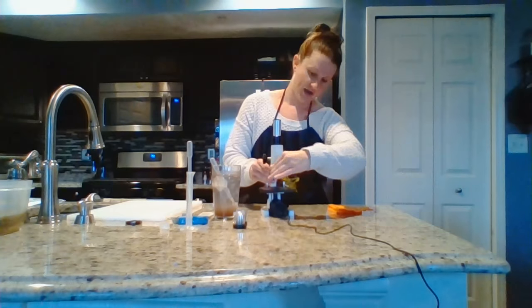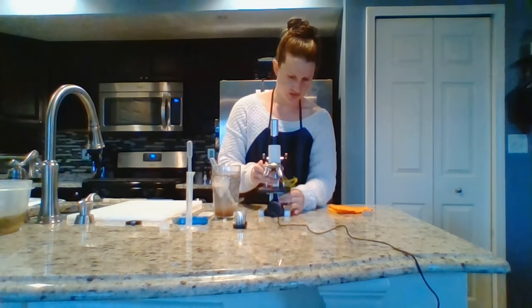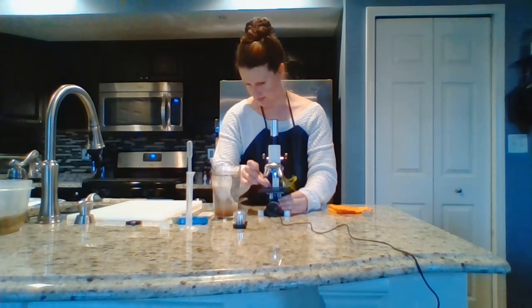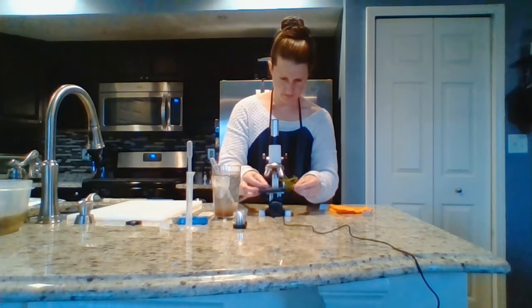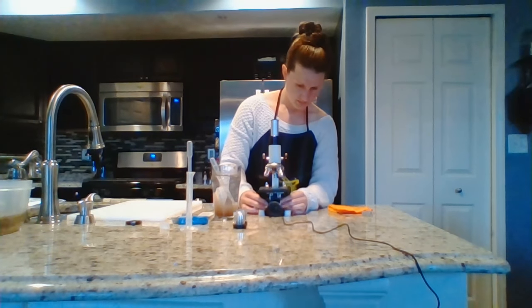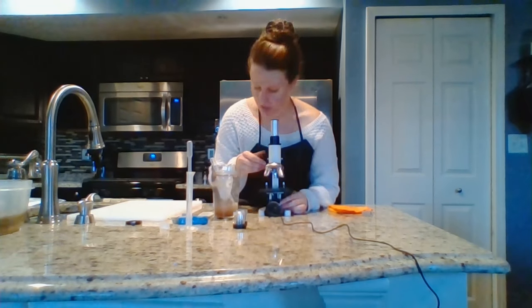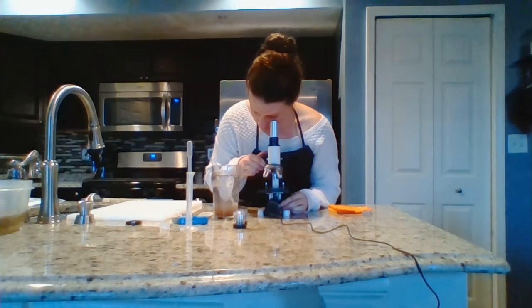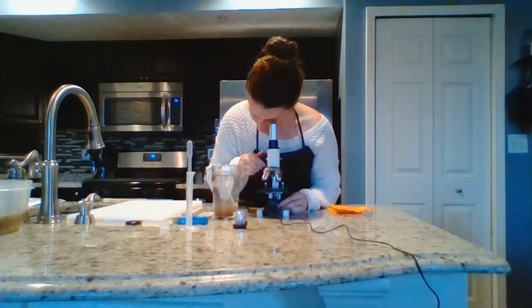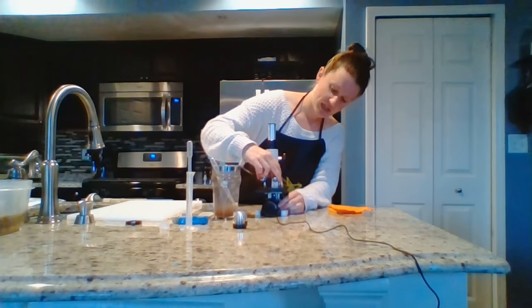Make sure you're all the way at 4x first. Make sure your light is shining up and adjust until you can see your little baby shrimp. Once you see them at 4x, increase your magnification to 10x.